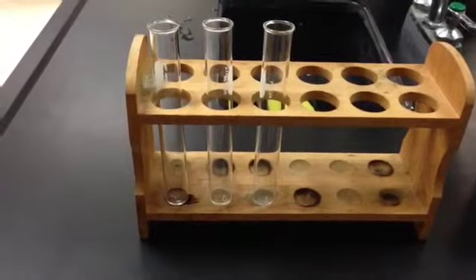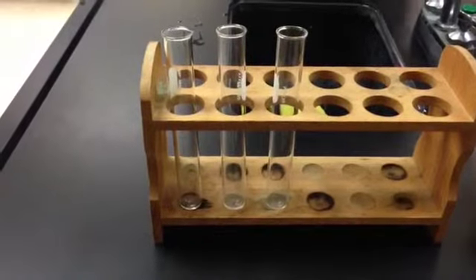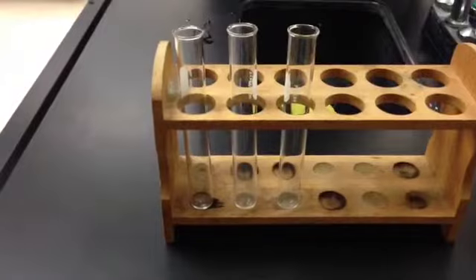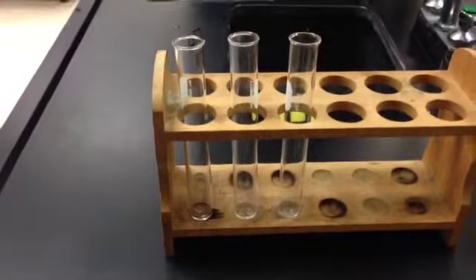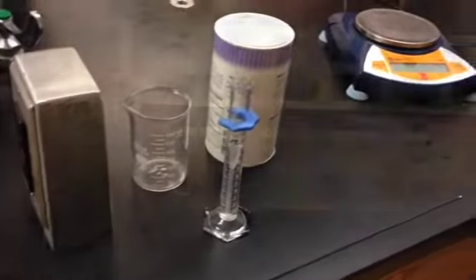Today I am going to demonstrate an example of solubility using salt, also known as NaCl, and water. In this experiment, I will show you that different amounts of salt and the same amount of water will not always dissolve because of its solubility. And here are the materials I will be using.